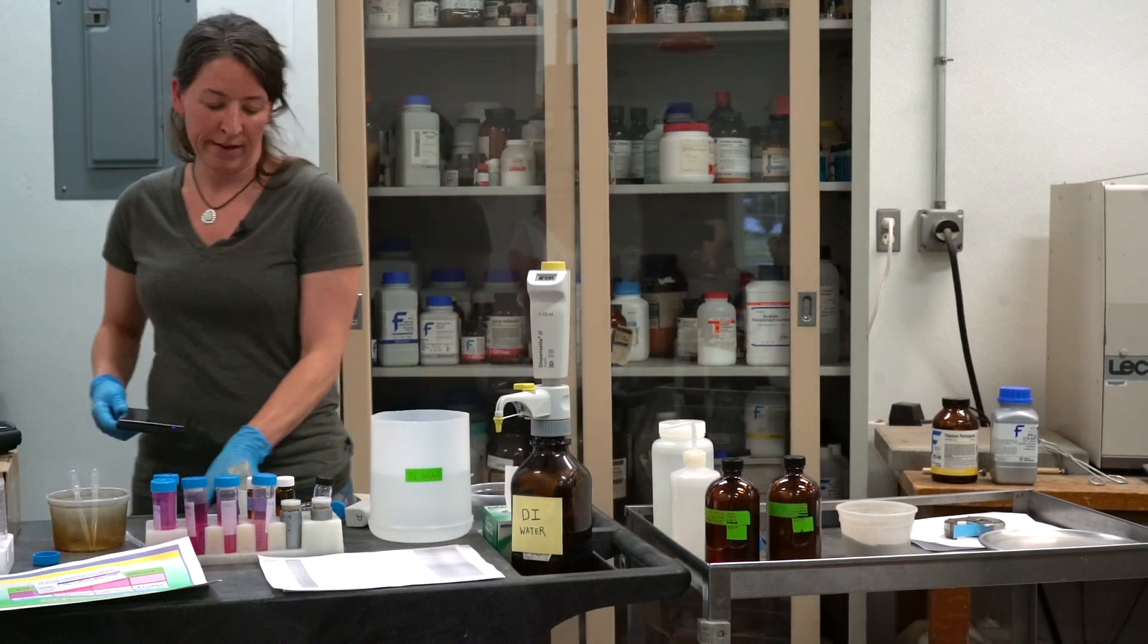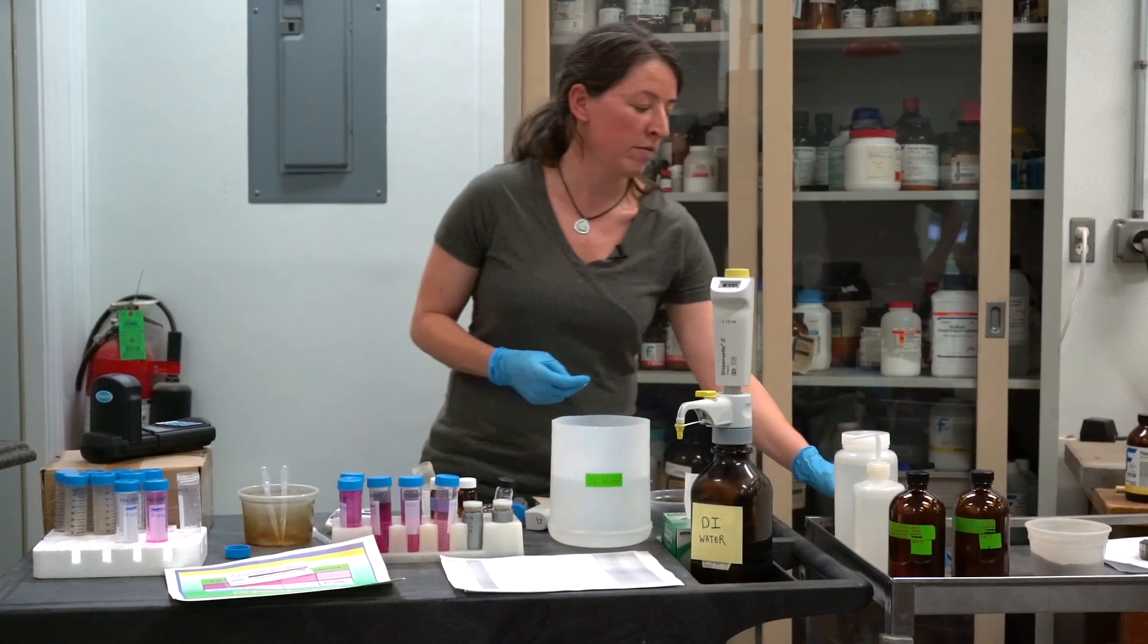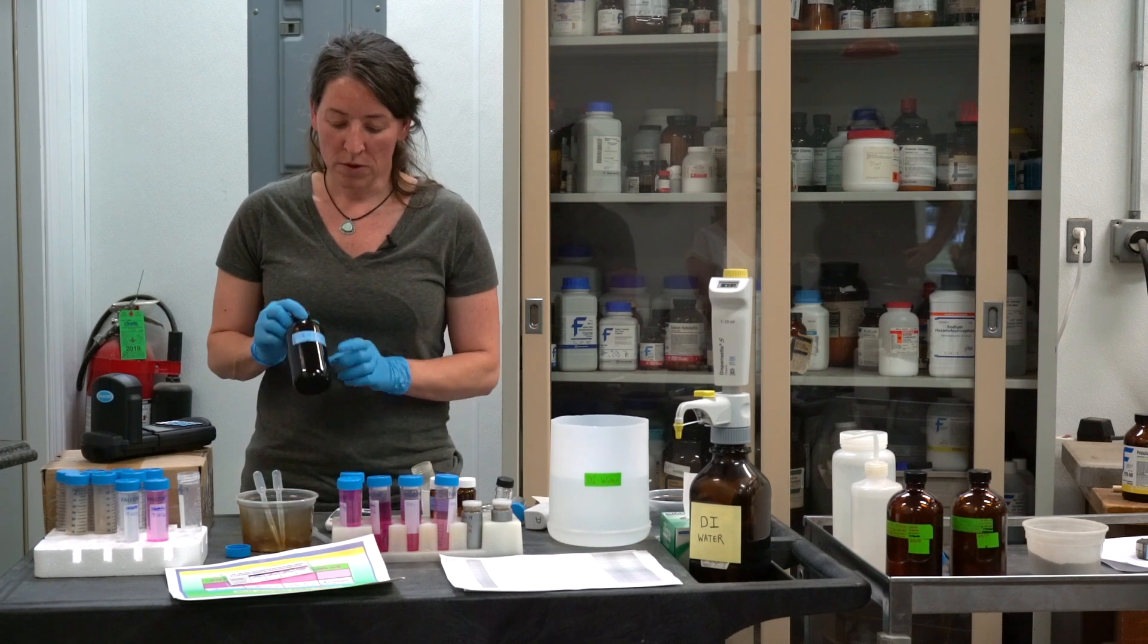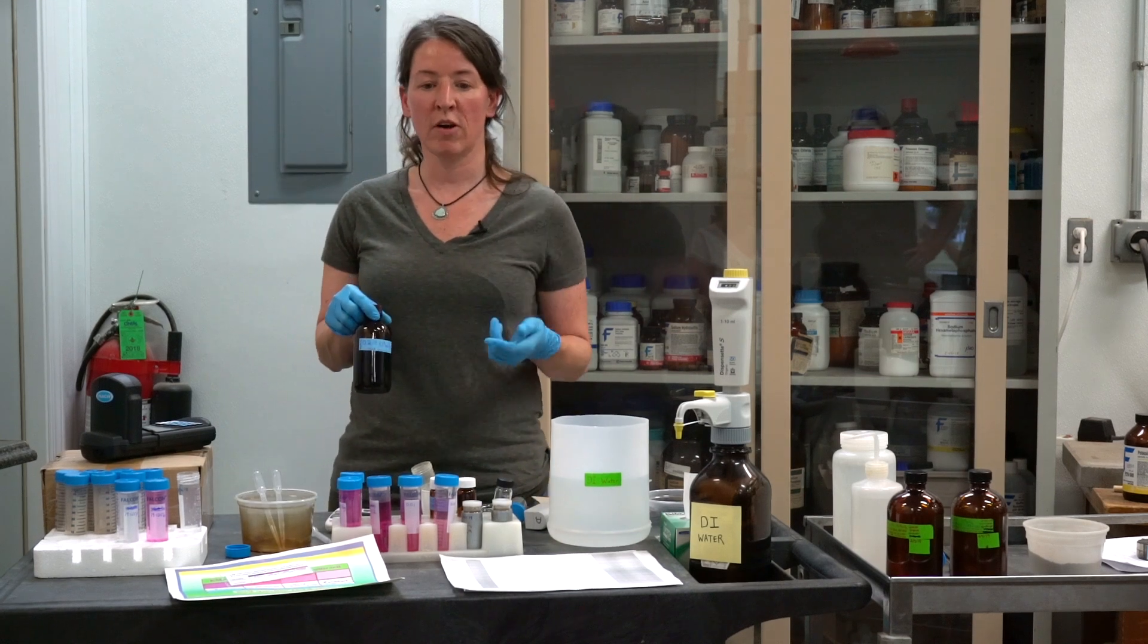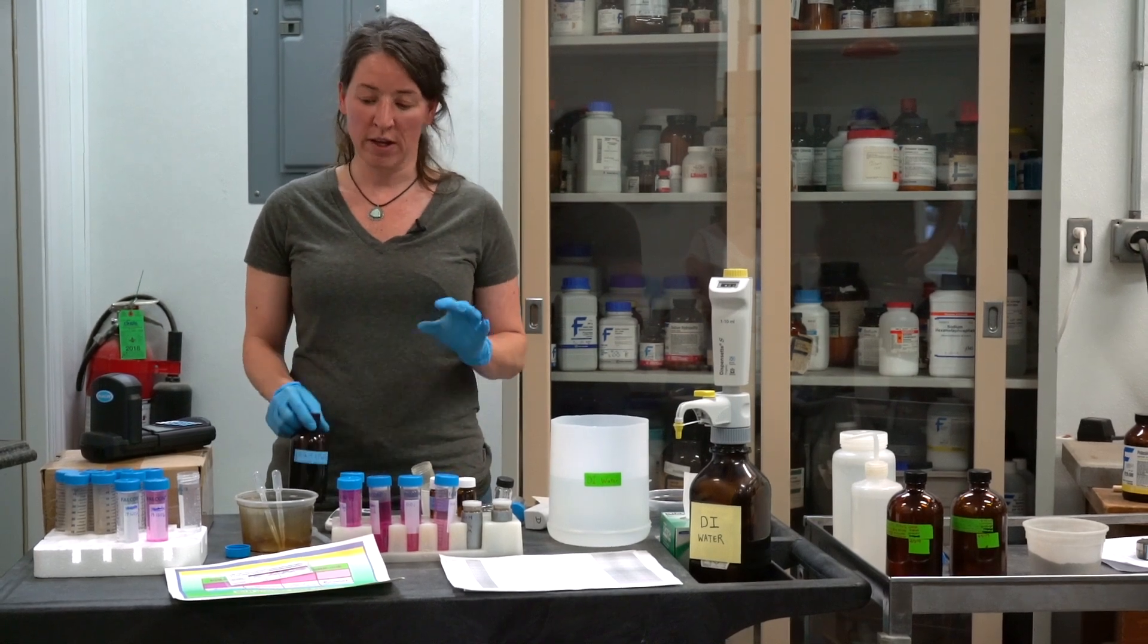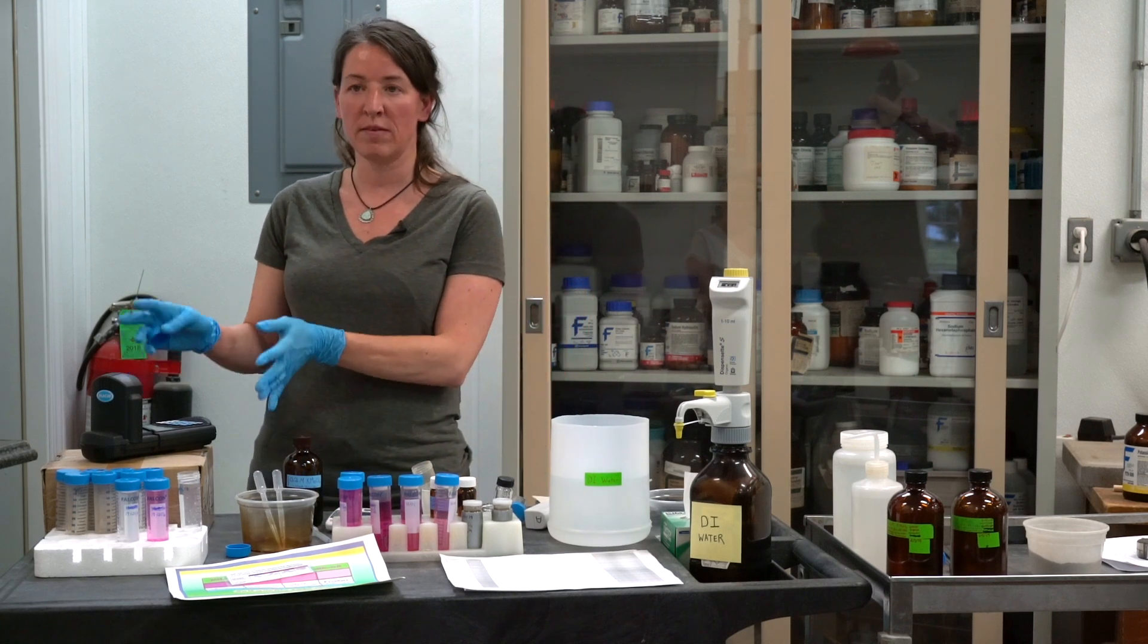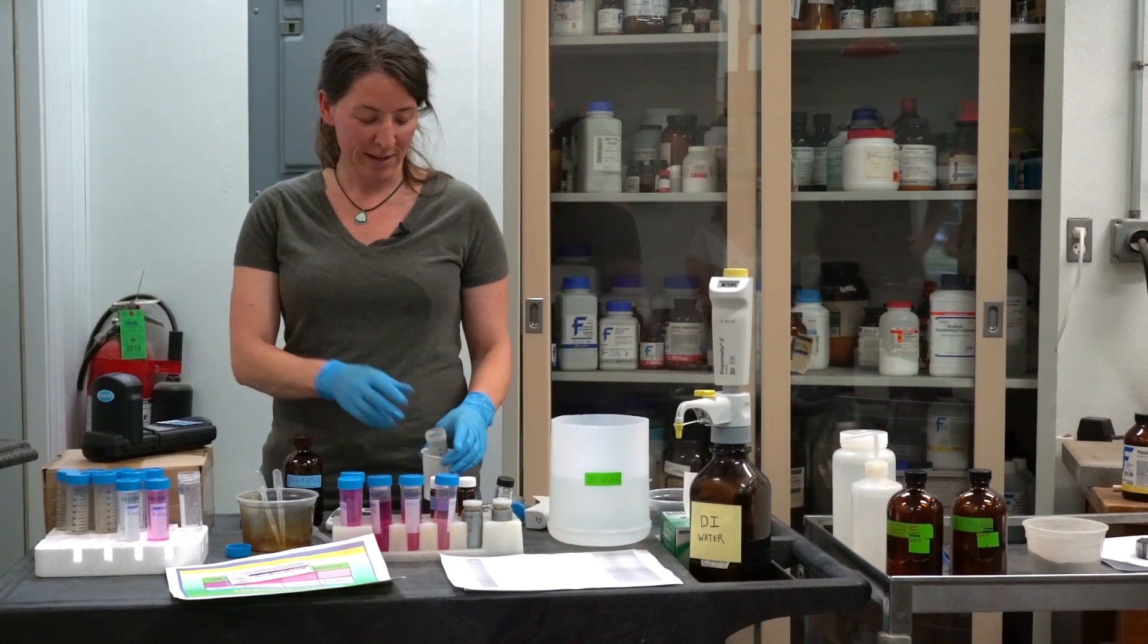The next step, we're going to add 18 milliliters of deionized water, and then 2 milliliters of our stock potassium permanganate solution that we made beforehand. The important thing about this potassium permanganate is once it touches the soil, the reaction starts. So it's a timed reaction. You need to make sure that you're organized. When you add it, the first step is 2 minutes, second step is 10 minutes. So as soon as you add the potassium permanganate, time starts. So I add that last.